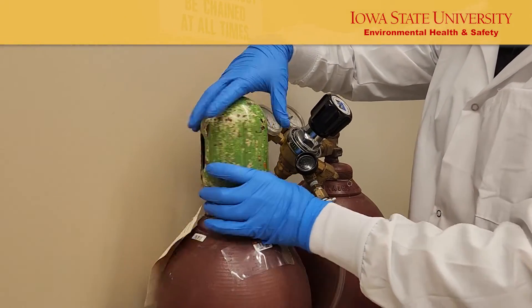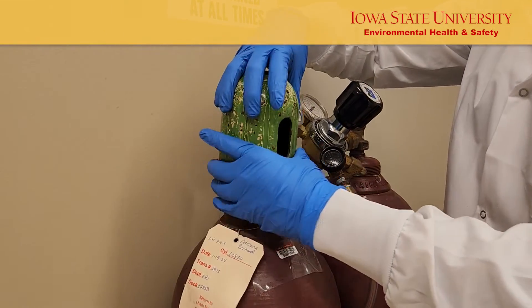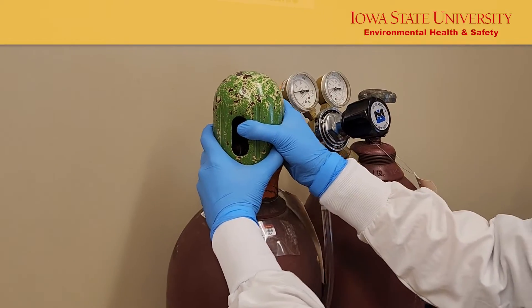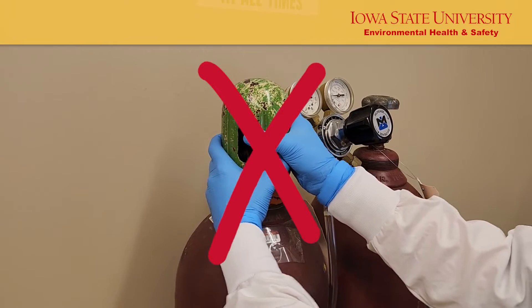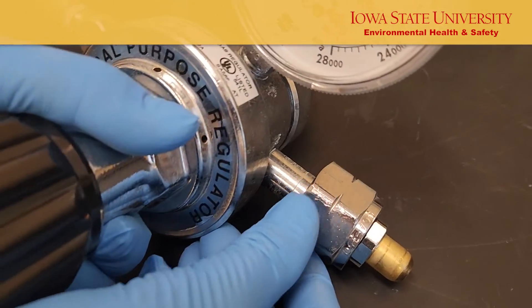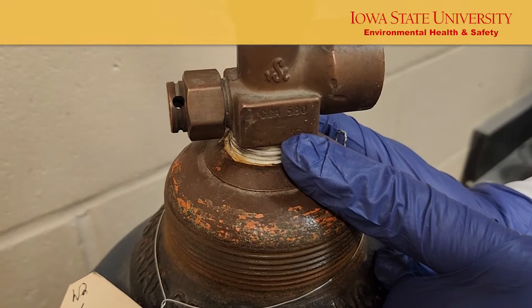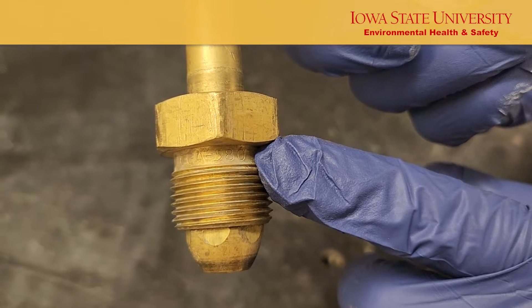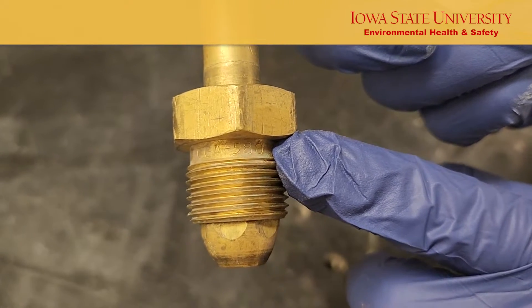Remove the cylinder cap. Use a cylinder cap hook to help loosen tight cylinder caps if needed. Never apply excessive force to pry off caps. Make sure to select the correct style of regulator — the CGA number on the valve should match the CGA number on the regulator. Never use adapters to connect cylinders to regulators.